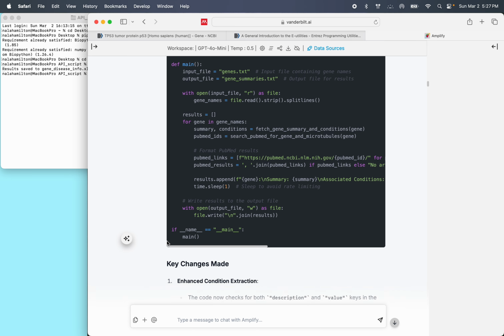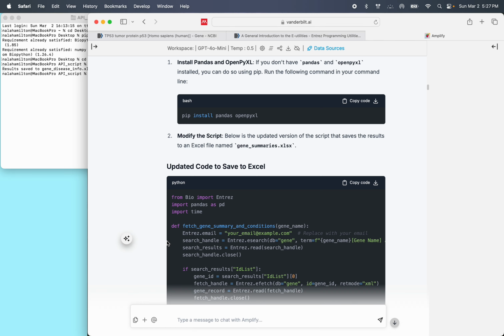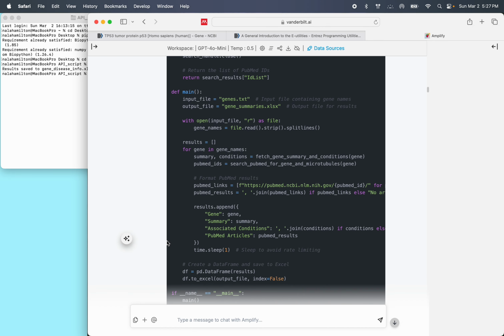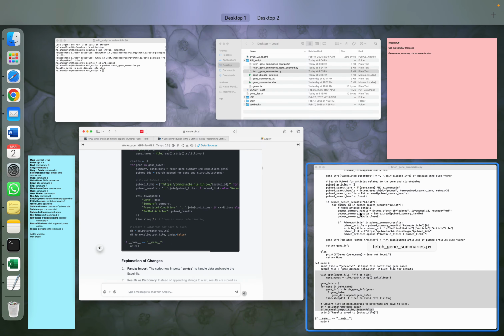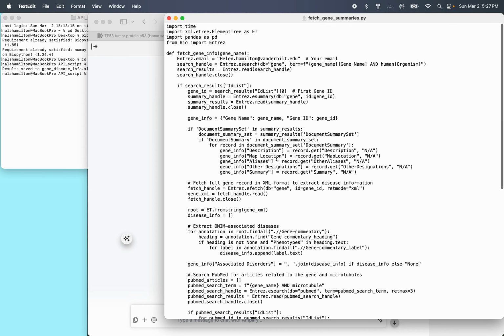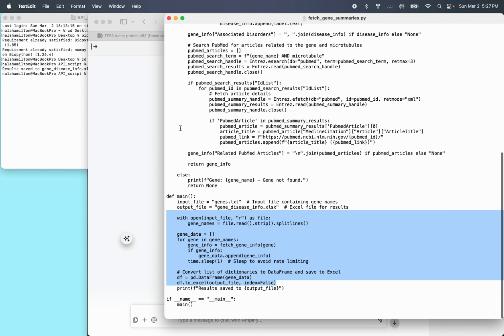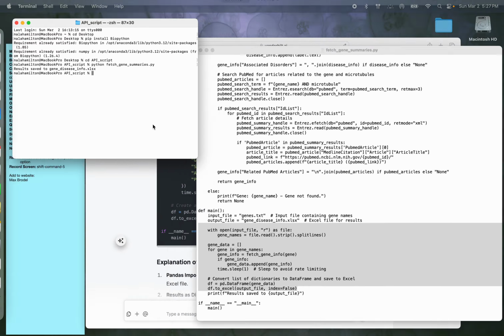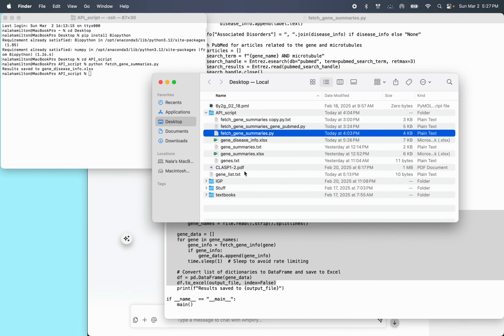There's definitely something in here that I'm having trouble finding at the moment, but basically you can just ask chat that you want the results of this code to get printed into the terminal, and then once it looks good you can then save it as a file. So the results are saved to this file. I'm going to look for that.